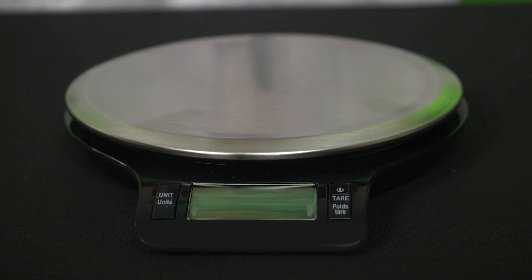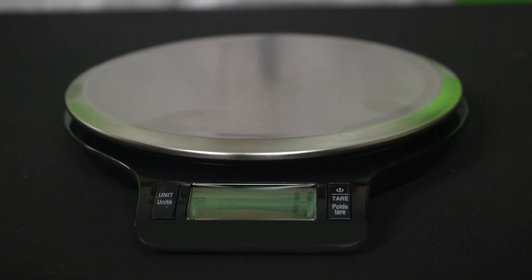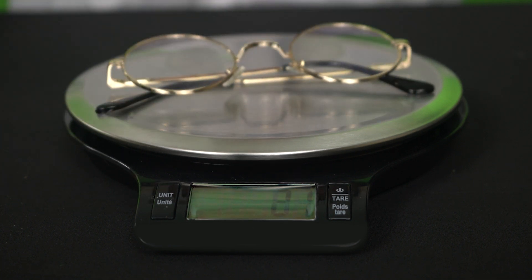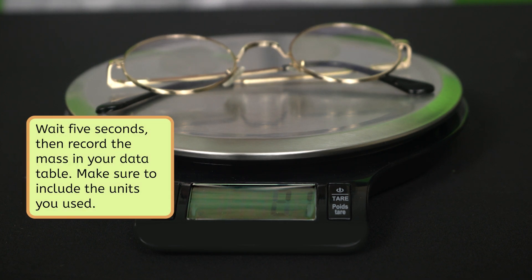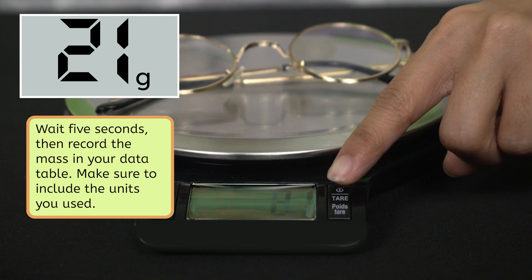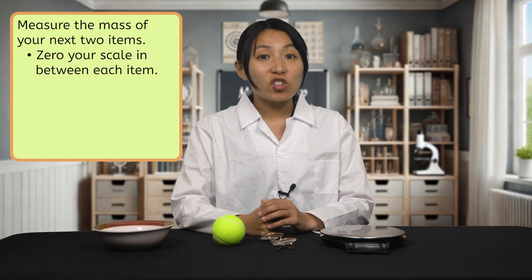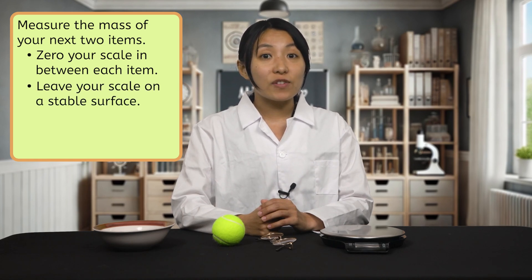Now that you've made your predictions, let's test them out by taking accurate measurements. Make sure the scale is on a flat, stable surface. If it's wobbly or tilted, your measurements might be off. Before you place your first item on the scale, make sure your scale is starting at zero. If you have a zero or tare button, press that to be sure that you're starting at zero. Once you've zeroed your scale, set your first item on the center. Wait five seconds to let the mass settle. Then record the mass in your data table. Make sure to include the units you used. Repeat this procedure to measure the mass of your next two items. Zero your scale in between each item to make sure your measurements are accurate. Be sure to leave your scale on a stable surface the whole time.